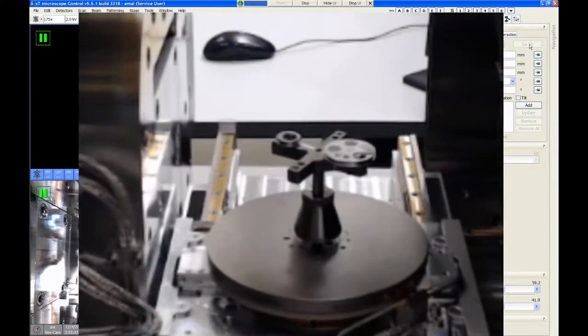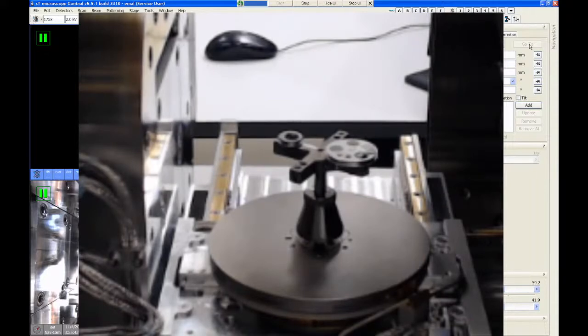Just get them close. The biggest problem that we're worried about here is that if we're doing very high resolution SEM imaging, you could have your sample very close to the lens. And then if you move the stage sideways, the taller sample can run into the SEM lens, and that can cause some damage. And even if you're not doing just high resolution imaging, if you're working with the FIB, the stage will be tilted. And when you tilt the stage, you quickly run out of extra room above the samples. So it's actually much easier to bump into the side of the SEM lens when you're tilted than when the sample's flat. I found from my experience that as long as the samples are within about a millimeter of height with respect to each other, you're usually okay.